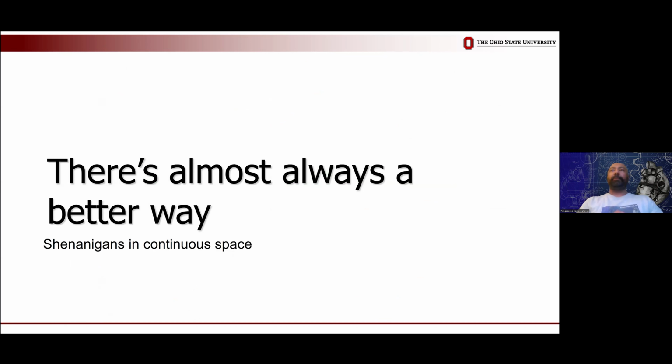Now, what if we're operating in continuous space? You don't have pixels or voxels. You're just going to have point coordinates in some volume. This is a common case with localization microscopy, STORM, PALM, MINFLUX, etc. And so what do we do about this? And here the point I want to make is no matter how good your methods are, always be thinking about, is there a better way to do something, right?